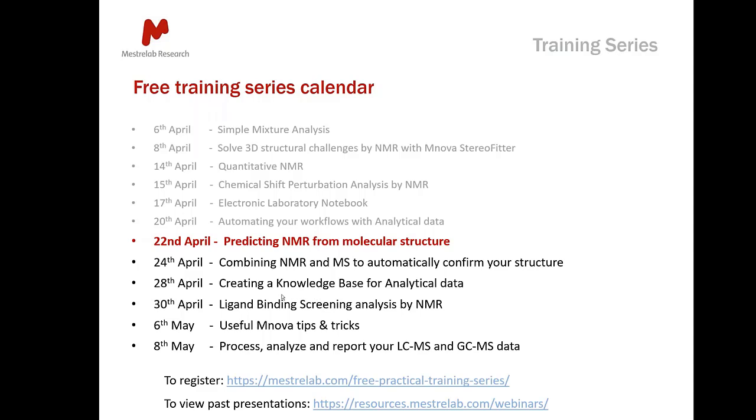And in the coming few days, we're also going to have the NMR and MS for structure confirmation, Verify, knowledge base, database for analytical data, spectral databases, ligand protein binding screening using NMR. That's our screen. And we are also going to have two newly announced ones in May. That's the tips and tricks using Mnova. And the process, analyze, and report your LCMS and GCMS. That's Mnova MS. We are going to have more to announce as well.